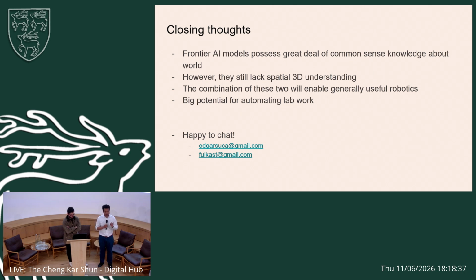I guess we haven't presented this here, but the goal is to eventually have a predictive nature to it as well, so that from a few frames you're able to better predict how the 3D will unroll. So, encoding the 3D dynamics.